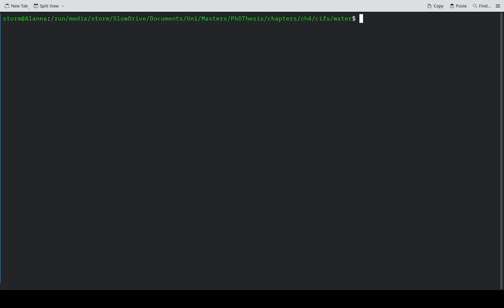Whatever you have. This will, in fact, also work on PowerShell because it's aliased all of these relevant commands into place.